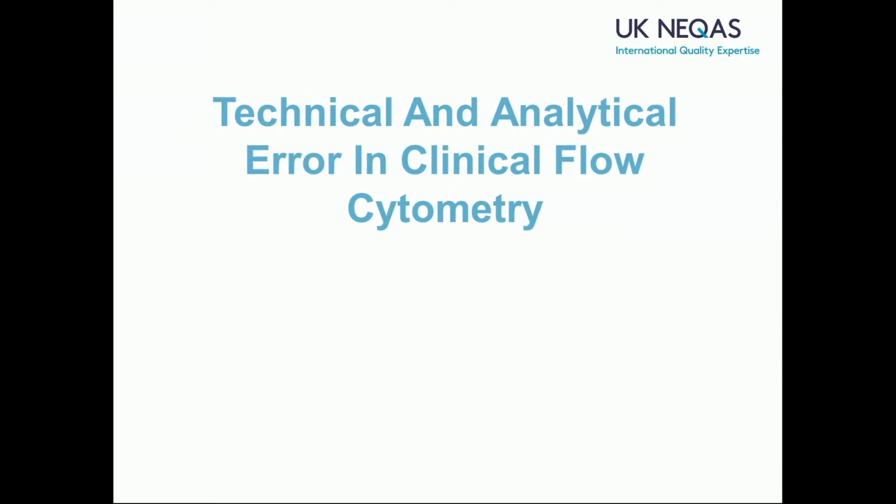I'm going to talk to you a little bit about technical and analytical error in clinical flow cytometry. It will cover electronic trials, and some of the issues that we've just been talking about with plasma cell myeloma, MRD. But before I start, this is the UK NEQAS. We're talking about the findings and things that we've done over the last 12 months. Some of these projects have been with your help, so thank you very much.